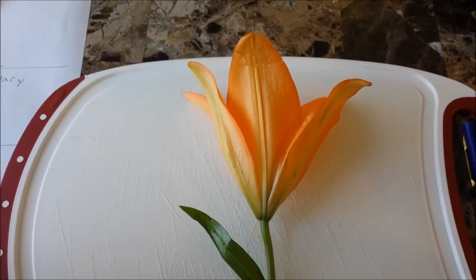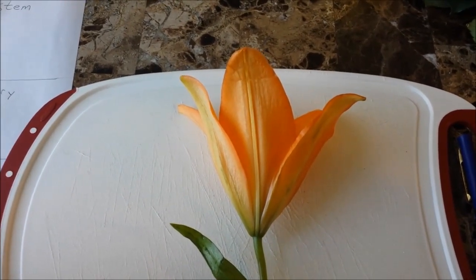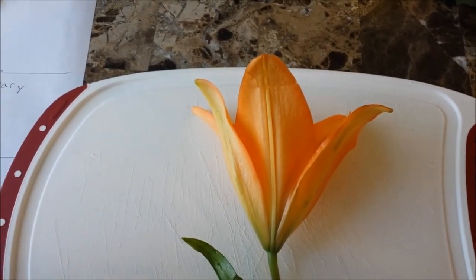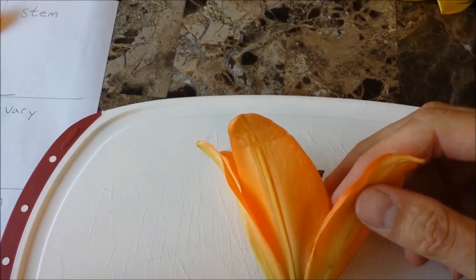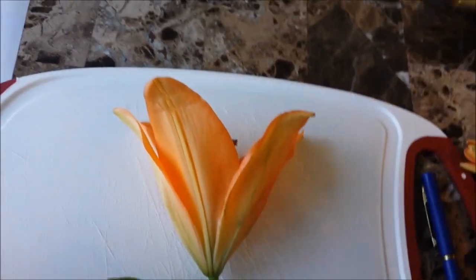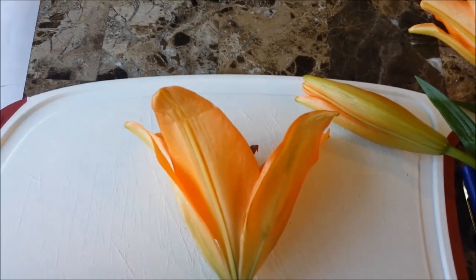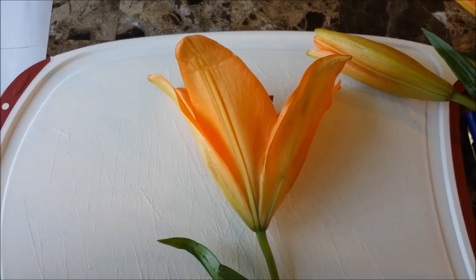To begin our flower dissection, we will be removing a sepal, which protects the flower petals as it is growing. In the lily or some other flowers, the sepal can look very similar to a petal, but in a lot of flowers, like this rose, you'll see that the sepal looks much different. If you were to look at an unopened lily, you would see that there is a difference between the petals and the sepals. So we will remove that and place it onto our paper.